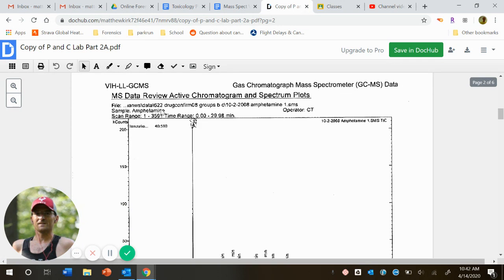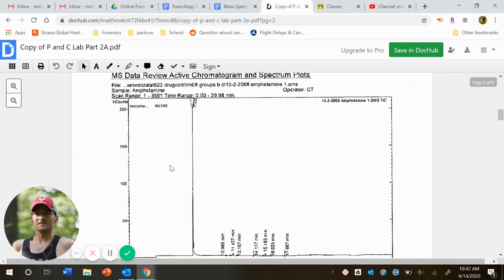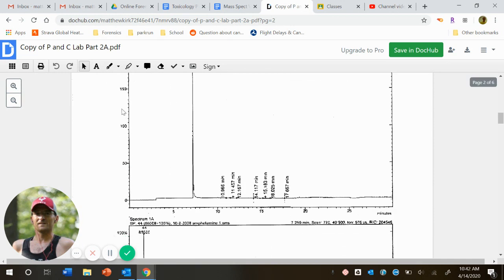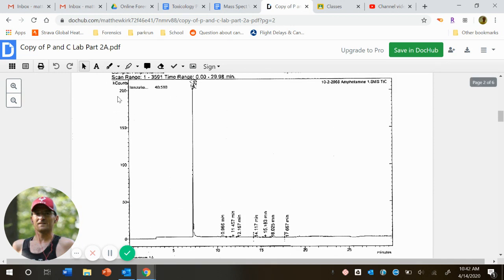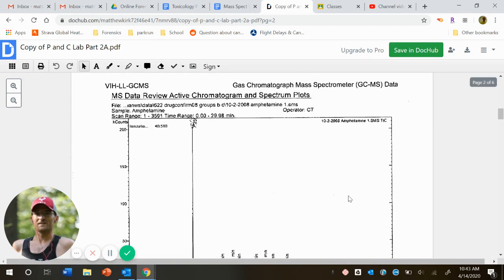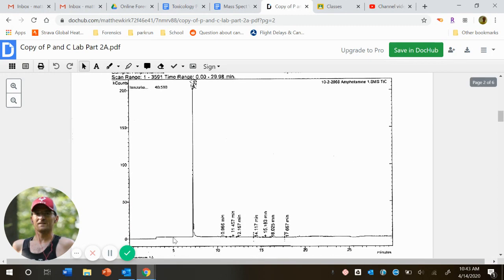When I go to my next, my second page, now I'm looking at the chromatogram and my spectrum for amphetamine, where again, same thing. Count on the y, and then my x is minutes for my chromatogram. And each peak represents a substance coming out.